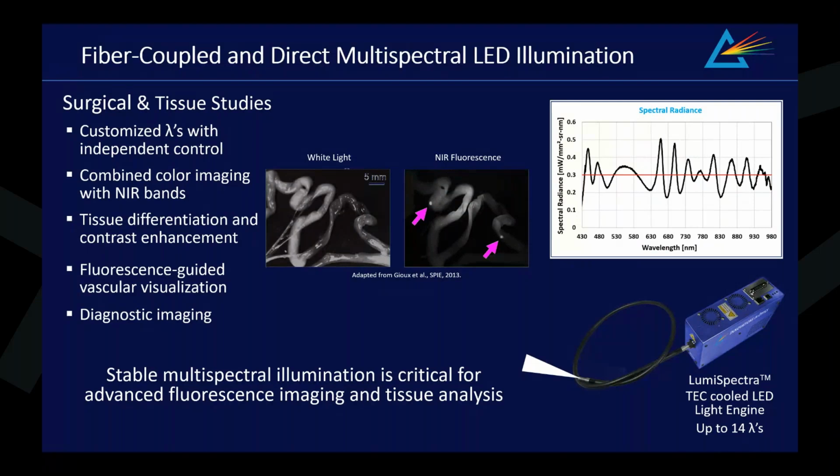As the number of LED die and wavelength channels increases, tighter temporal stability requirements may also require active thermal control, such as thermoelectric Peltier cooling devices, to maintain stable spectral output and optimize lifetime by maintaining a stable and low junction temperature of the individual LED die. Fiber-coupled delivery is particularly useful in endoscopic and minimally invasive imaging systems where flexible light delivery and high optical throughput are critical.